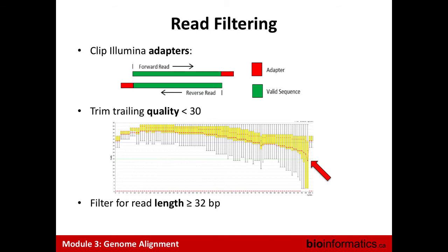After that, the second filtering we do: we start from the end of the reads, where there's the most chance of having bad quality bases, and for each read we look at the quality. The user can choose a value. Usually we choose a value of 30, so a 0.1% chance of error, and we remove all the bases that are under this value in terms of base quality.